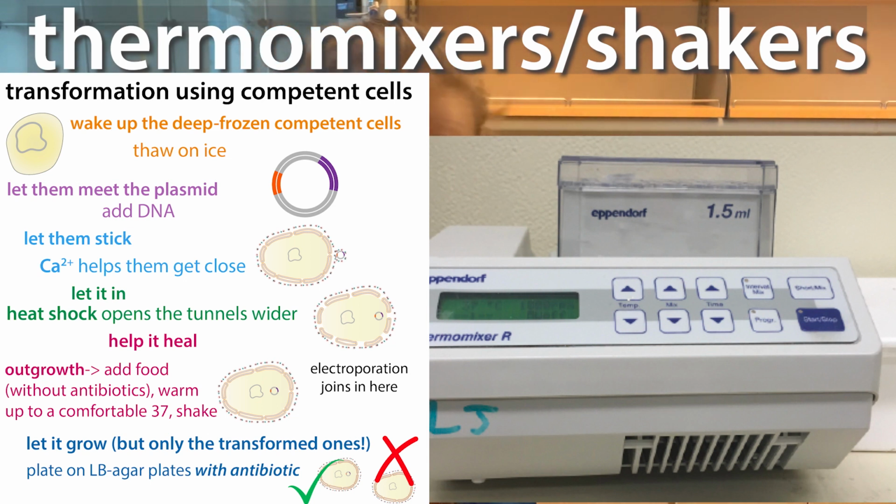And we can take that plasmid and stick it into bacteria in this process called transformation, often with a heat shock step, which we'll talk about what we can use for the heat shock in a minute. But basically, you can actually use this for a heat shock too.